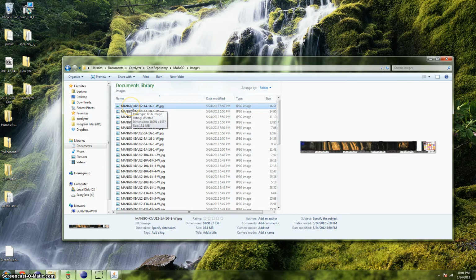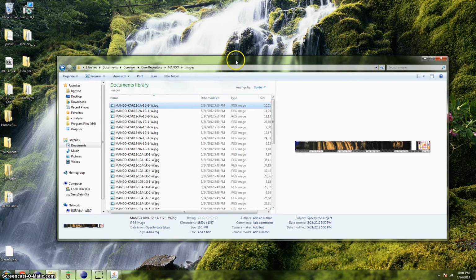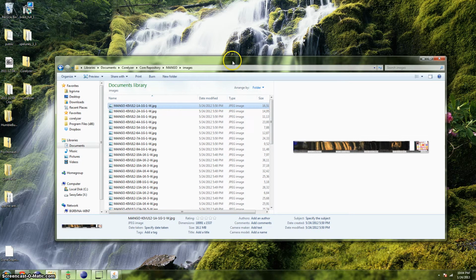You can use either hyphens or underscores to separate the components of the file name. Generally, it is a bad idea to mix the two, so use one or the other. Mixing may lead to strange results and cause you more trouble. Finally, before we get started with loading images, it's generally easiest to have all of your image files in the same directory. It's just going to make things a lot simpler.